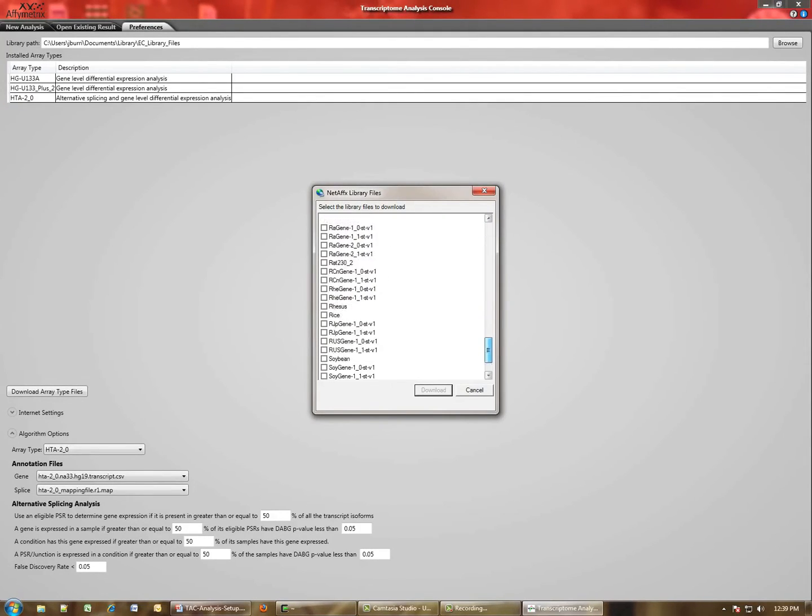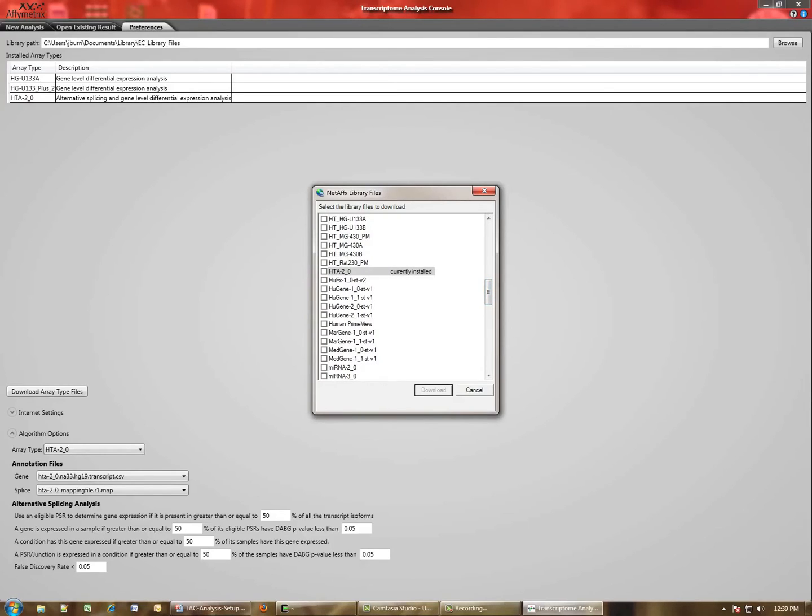And the ones that I've already downloaded, for example, the HTA array, are indicated as currently installed. Simply check a box and then hit the Download button to download the files to your computer.